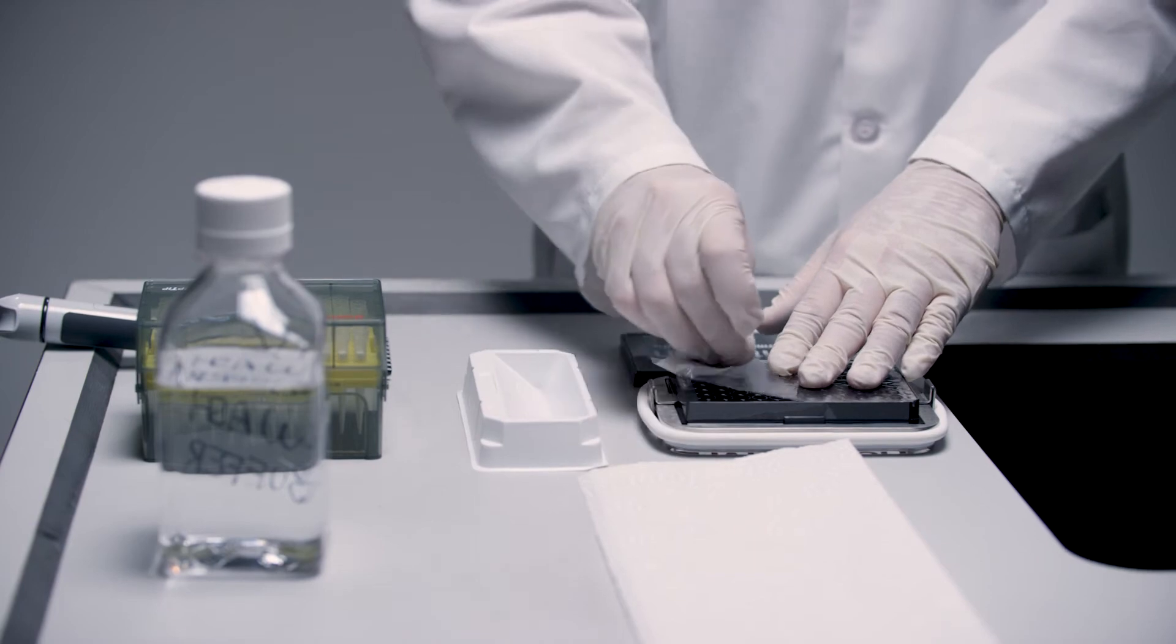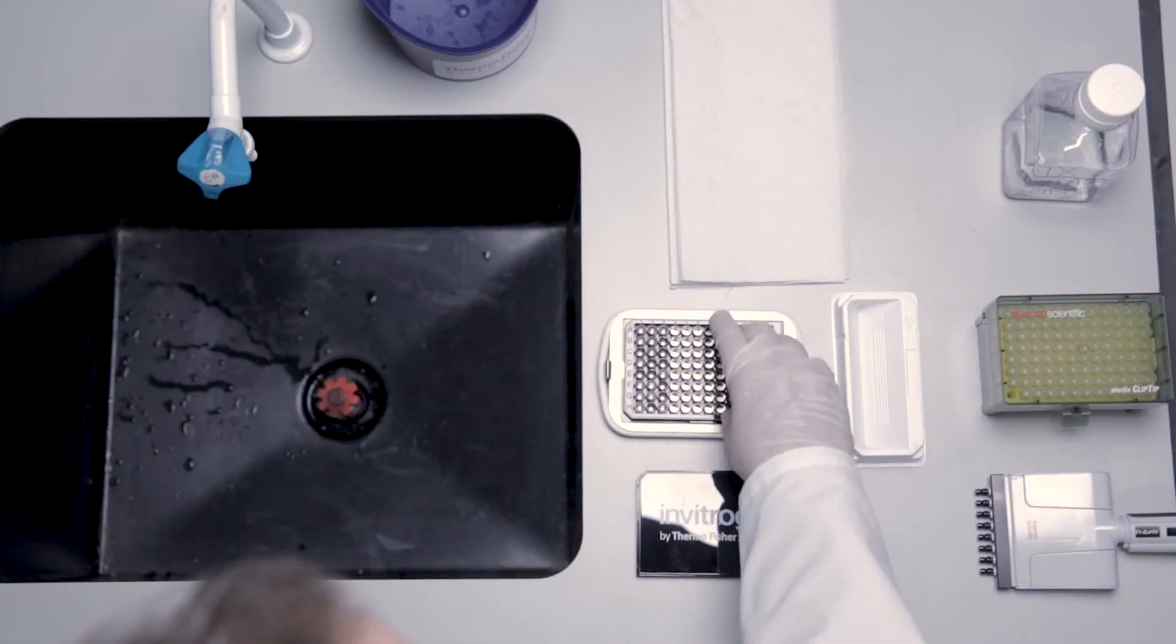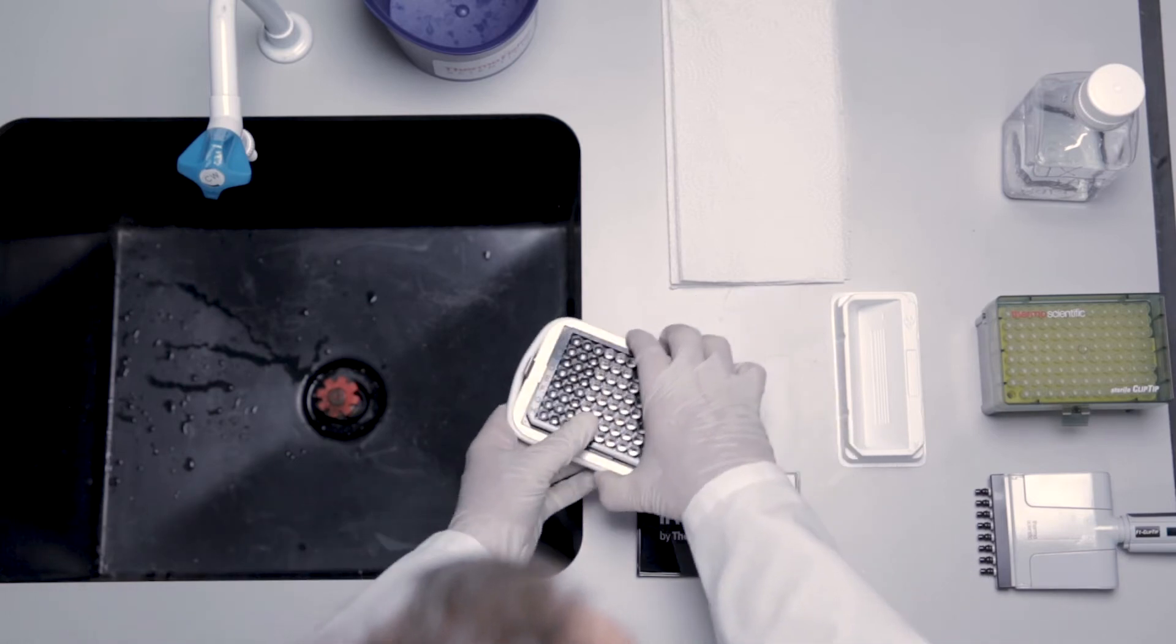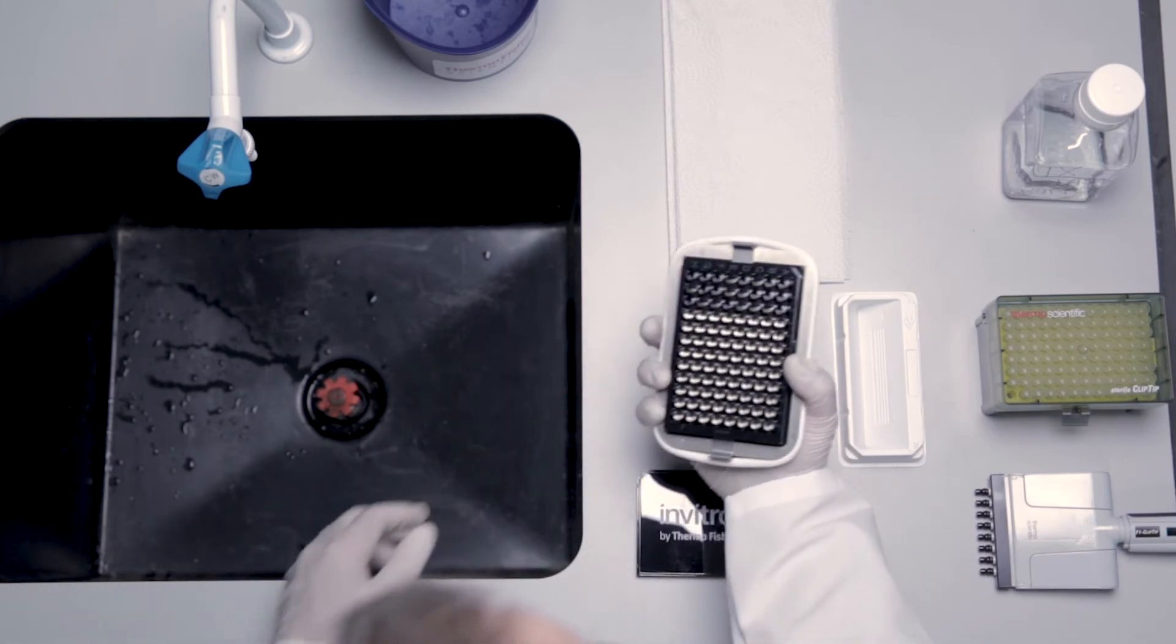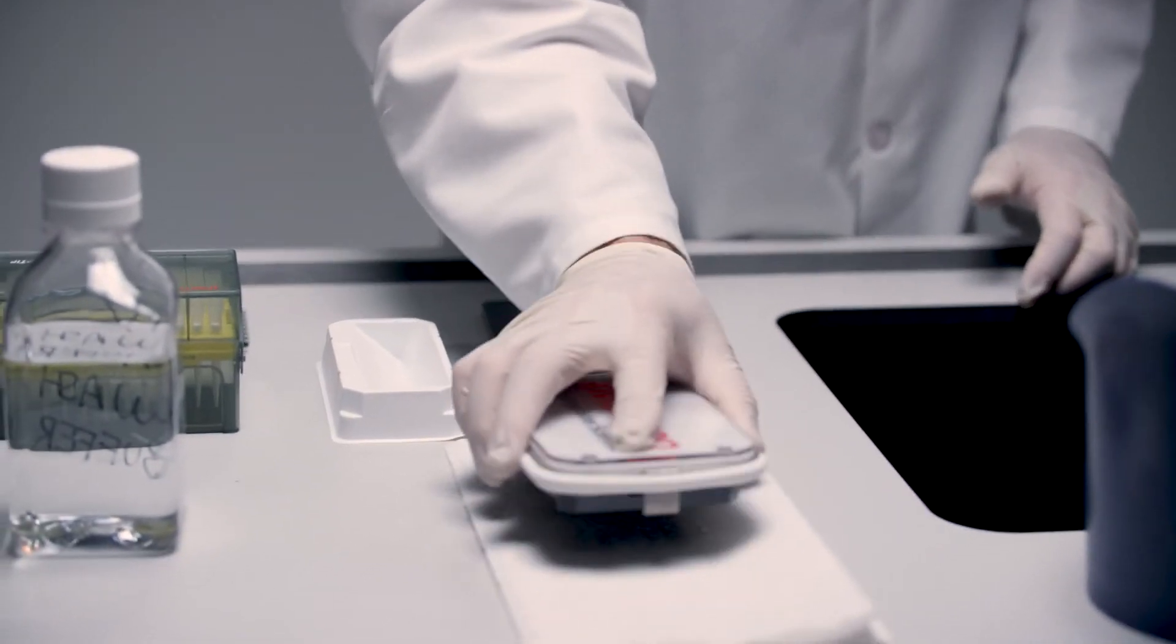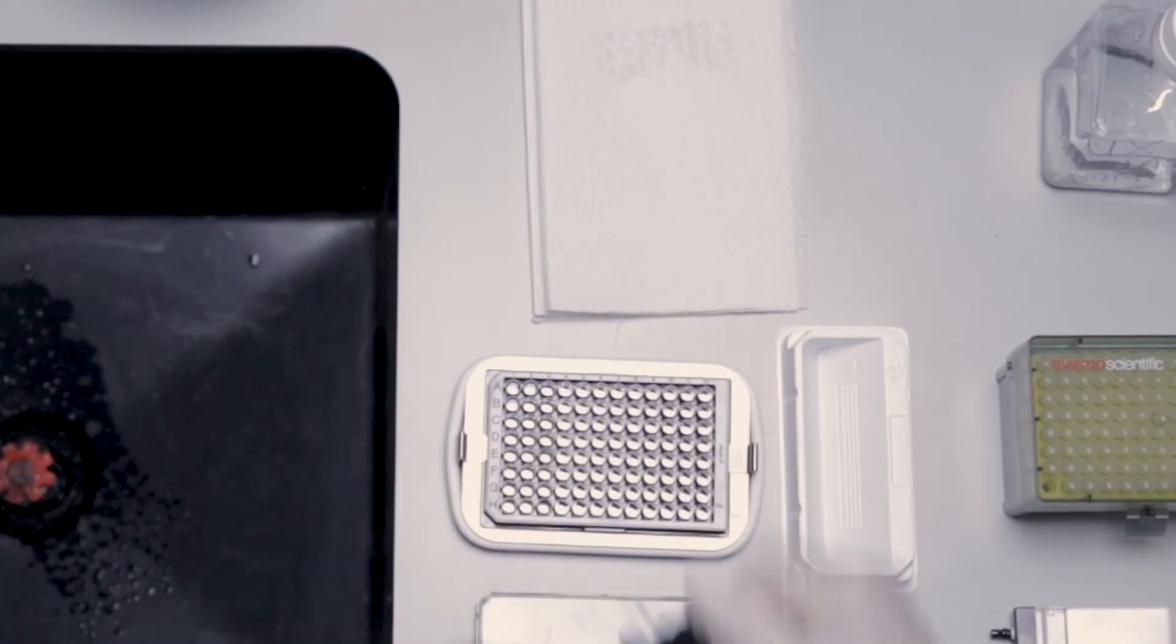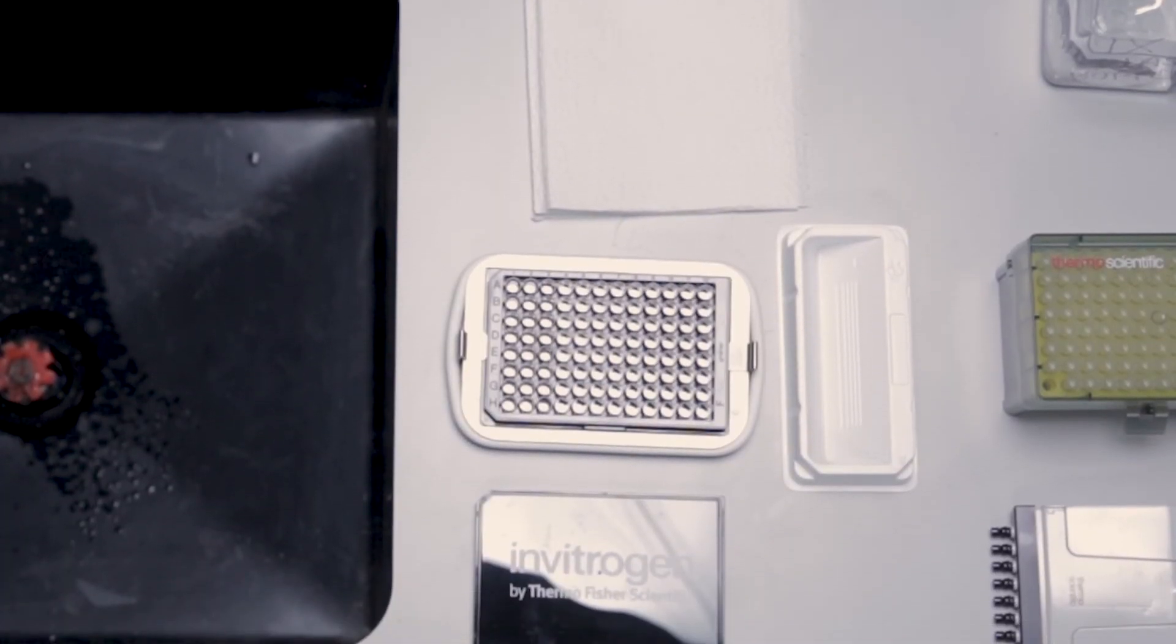To remove the liquid from the plate, remove the seal from the plate and take the handheld magnetic plate washer with the inserted plate and quickly invert with force over a sink or an appropriate waste container. Blot the inverted assembly onto several layers of paper towels or another absorbent surface to remove any residual solution.